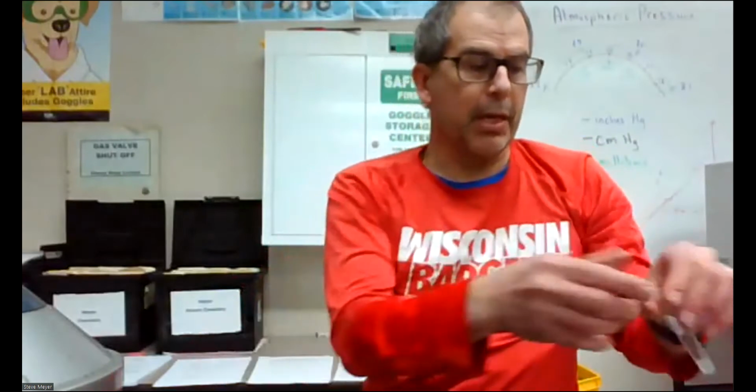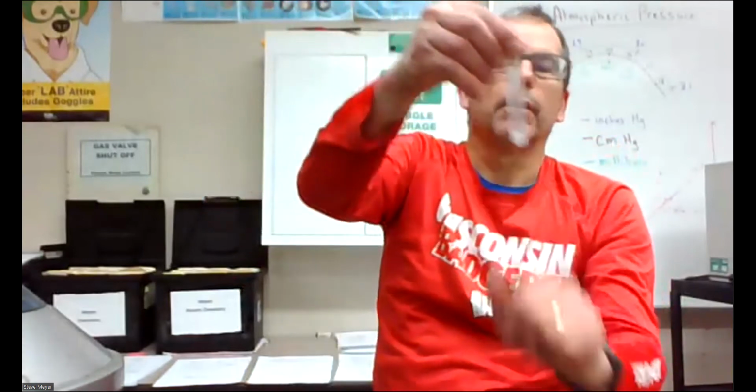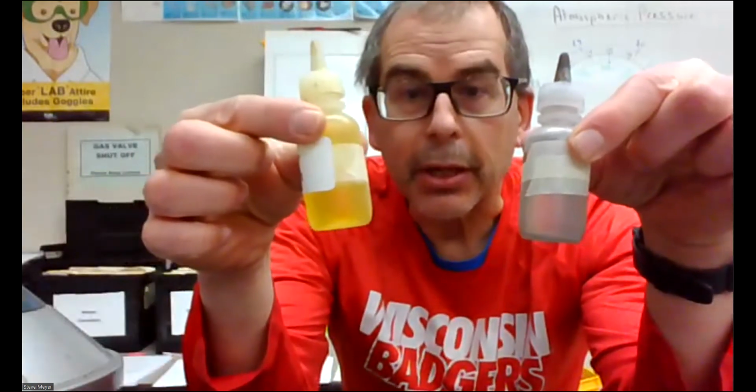Looking back at it, in the first reaction, I have an aqueous solution of silver nitrate, which is pretty much clear, and clear aluminum chloride. When I combine them, I already pre-did this, it's a white cloudy precipitate. In reaction B, I have silver nitrate, a clear solution, and a clear yellow solution of potassium chromate.